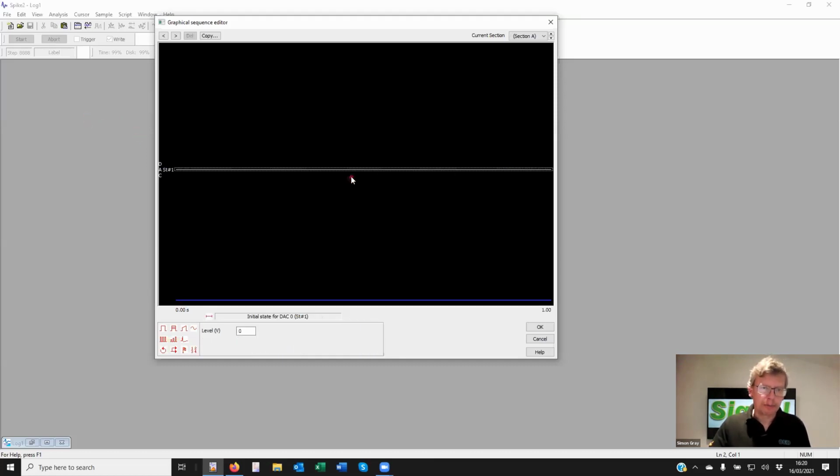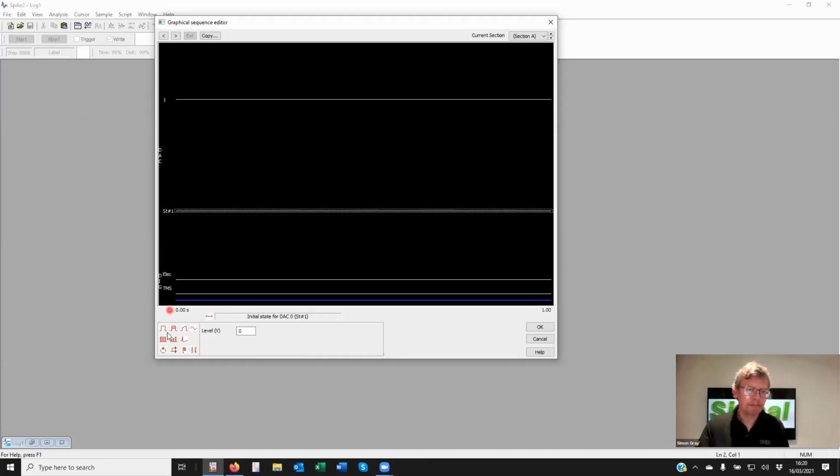Now, many people want to get lots of digital outputs. Now, this train of square waves I can put onto an analog line, or I can put onto a digital line. That's not true of something like a ramp, which can easily go onto an analog line, but can't go onto a digital line. And that's, of course, because digital is purely 0 or 1. So in our case, 0 or 5 volts, on or off.